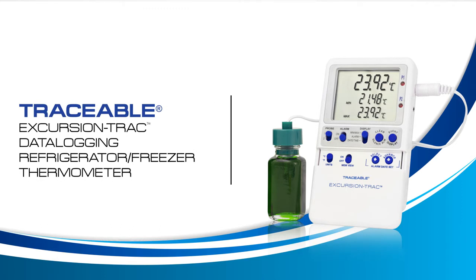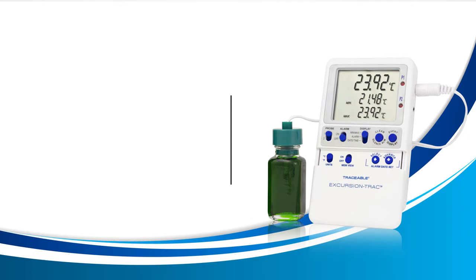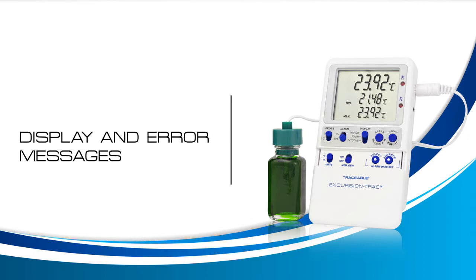Welcome to a Traceable Products instructional video for the Traceable Excursion Track Thermometer. In this video, we will learn about display and error messages. Let's get started.